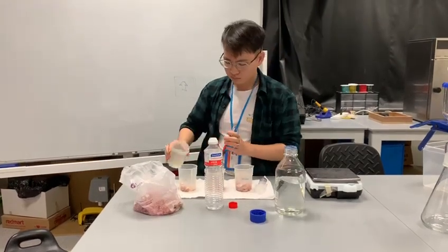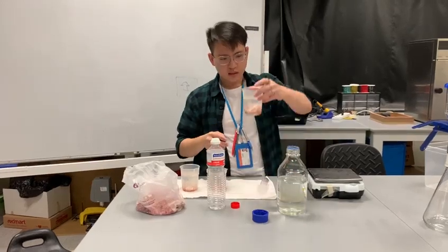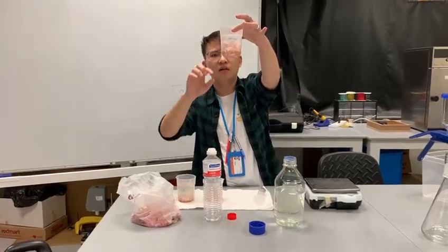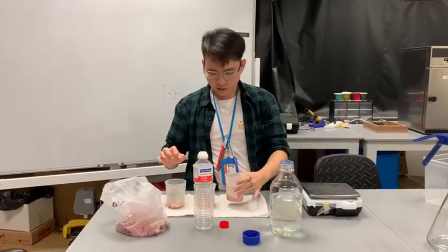As you can see, it should cover all of it. Actually, some of the bubbles are already being formed.